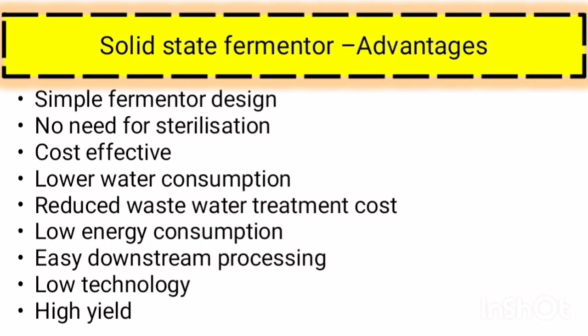The solid state fermentation process has certain advantages. It requires only simple fermenter design. There is no need for sterilization. Then it requires lower water consumption, so thereby the cost for the wastewater treatment can be reduced.